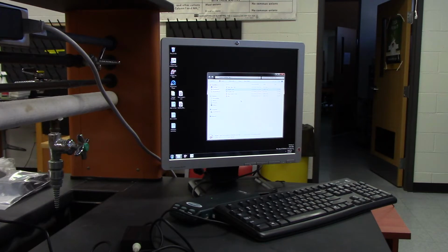For the first 2, Boyle's Law and Gay-Lussac's, we'll be using a probe, which is just a way of measuring results digitally. And the name of the company is Vernier. They've been making probes for a long time. You may have used these. I know middle school teachers that have used these types of things before. So they're quick, simple types of instruments used to get us really pretty good data.